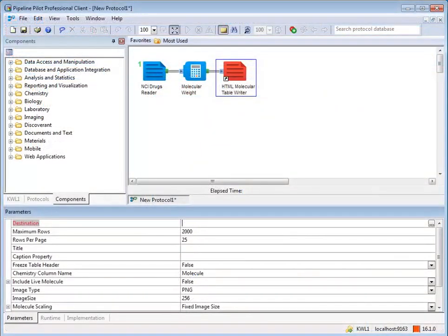When you know you are going to want to use a protocol in WebPort, you can set it up so that it will display and run in the interface. We'll now review setting up a WebPort-friendly protocol.